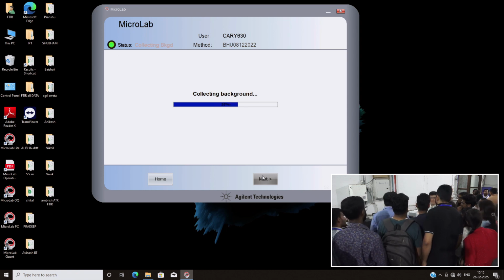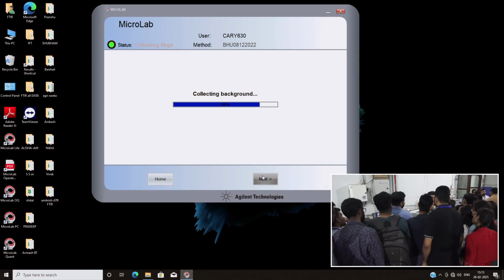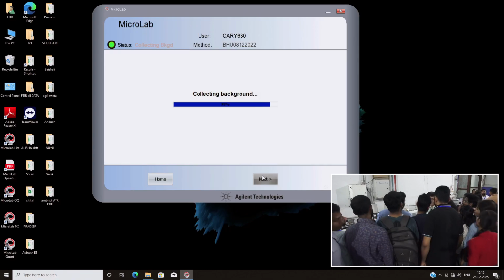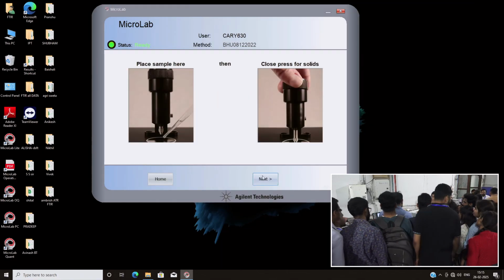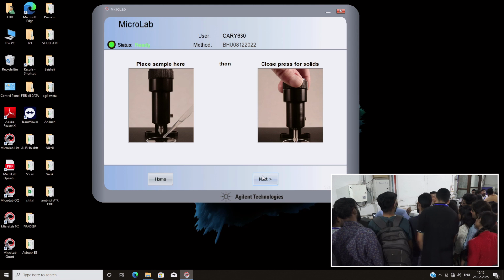It's fast enough. So when I was a postdoc, I accumulated the data for 8 hours. And in total 32 hours, I get 1 spectrum. Okay. Accumulation of 8 hours, 8 hours overnight. Higher wave number region, low region, solution, solvent. So 32 hours.